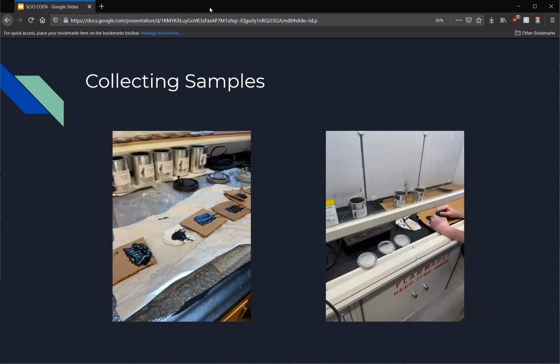Asphalt was our experimental sample. We had 10 samples in total, 5 anti-strip M and 5 anti-strip W, to test in ambient and without ambient light. Each sample was measured at least 10 times to provide enough data to create a better result for machine learning.